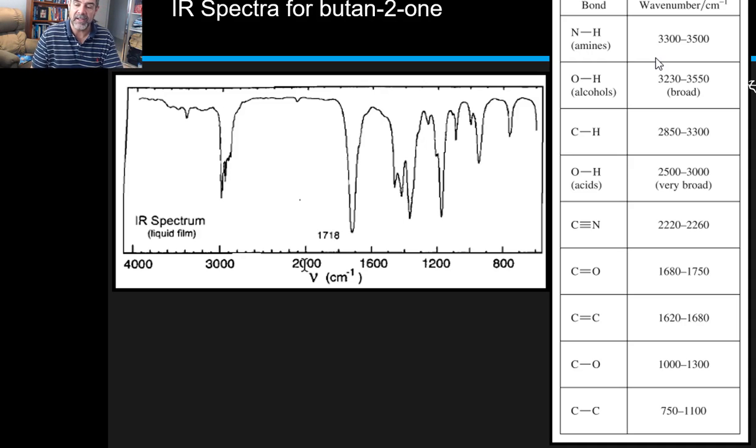And when you look at the output from the datasheet, the OH groups are up in the 3200 mark. But so are the carbon-hydrogen bonds. And this is the problem: when you see a value around here, are you looking at carbon-hydrogen bonds or are you looking at the hydroxyl group bonds? And that's why we need to remember that if it's a hydroxyl group, the output is much broader, not the spike. So the fact that we have no tongue means we do not have the OH group. So that's definitely out.